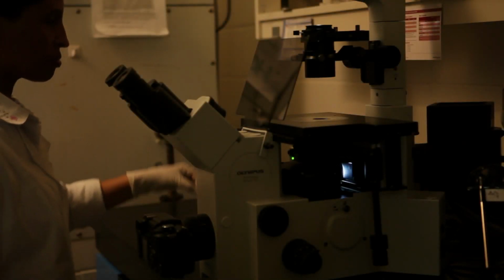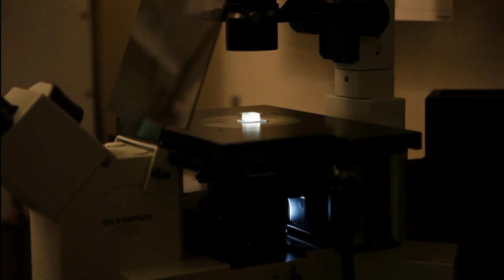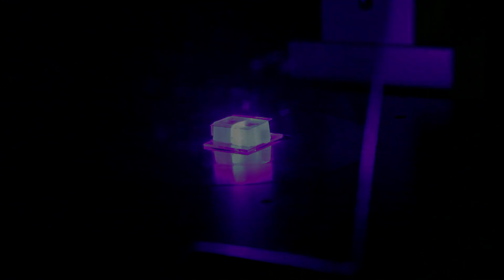You need an inverted fluorescent microscope, preferably with phase contrast and with a filter block for lucifer yellow. Under phase contrast, look for the edge of the electroporated area. You will see two lines. Under fluorescence, cells on half of the slide will be fluorescing intensely. The line closest to the glowing cells is the edge of the electroporated area. Any fluorescence beyond that is due to the transfer of lucifer yellow through gap junctions.